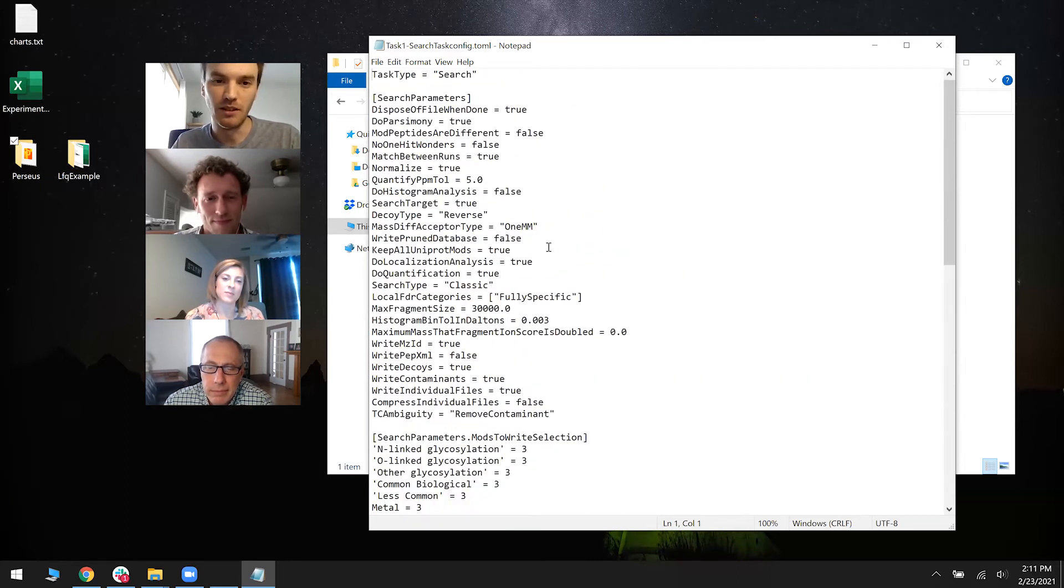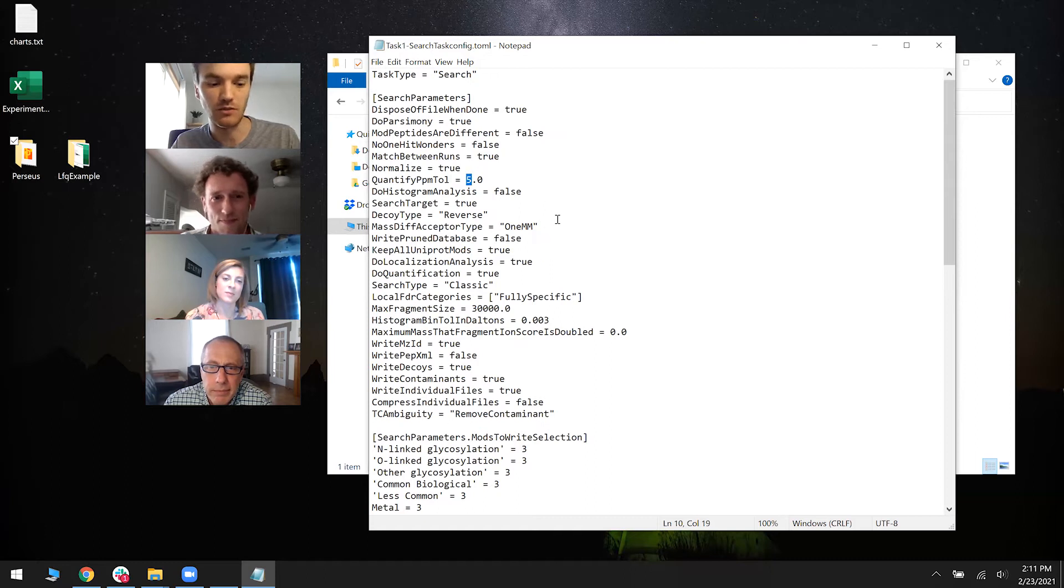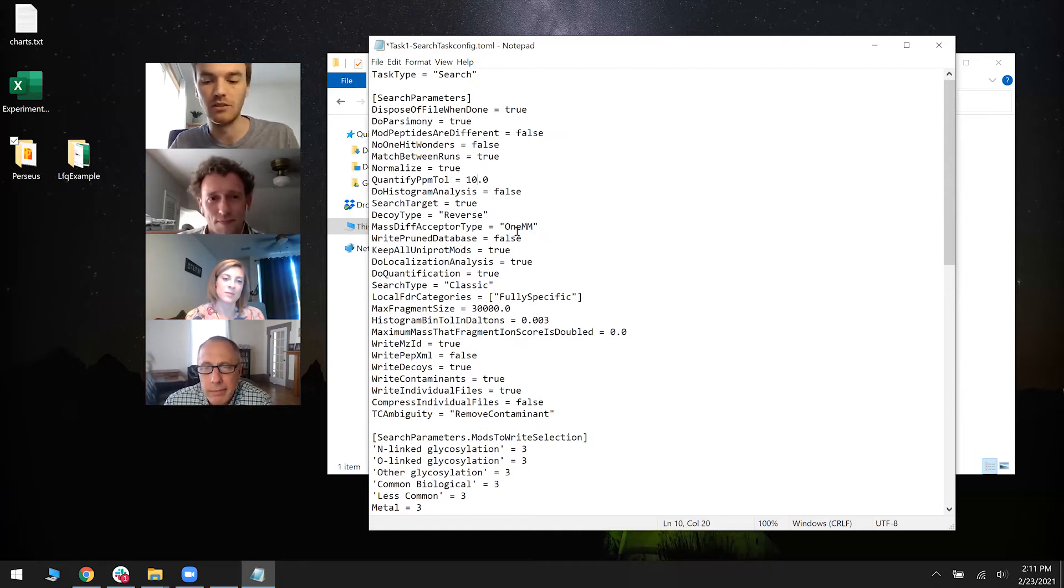But for example, if you wanted to change the PPM tolerance for quantification, you can make that 10 or whatever.